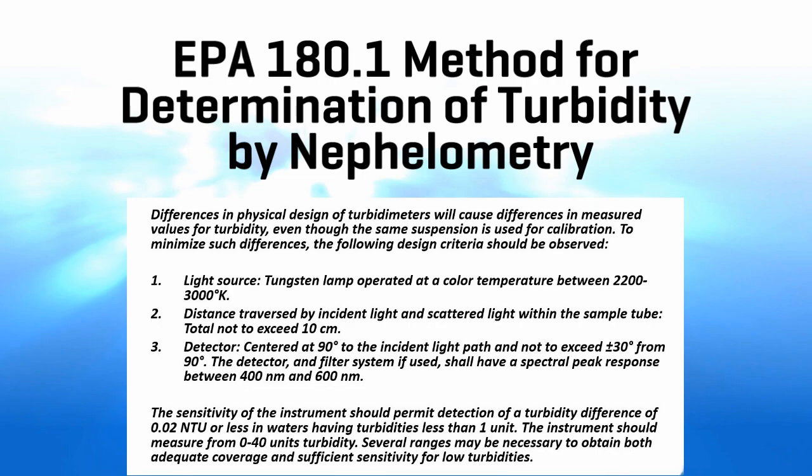NTU. So when you're doing your research for which meter you're going to buy, if you're going to be using it for compliance sampling, make sure that it at least goes up to 40 NTU or you will not be able to use it.